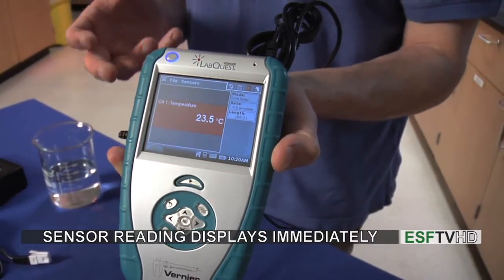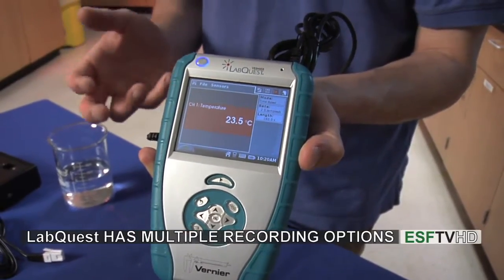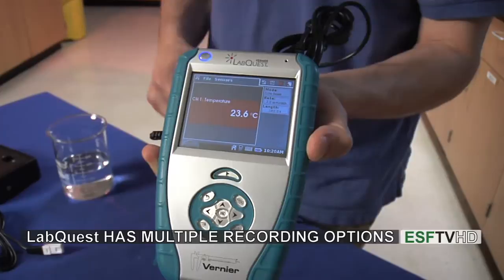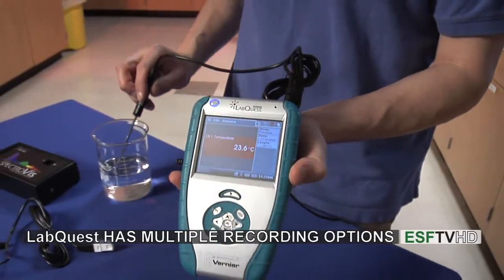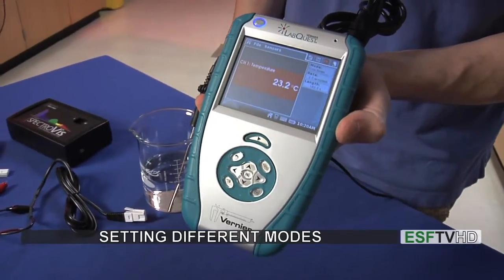It's very easy to just begin recording temperatures like that, but we can also set up an experiment so it will record temperatures when we want the unit to record, or over a specific time frame. Now I'm going to insert the temperature probe into a beaker of water, and we'll begin to see the temperature change as it goes into that beaker of water.